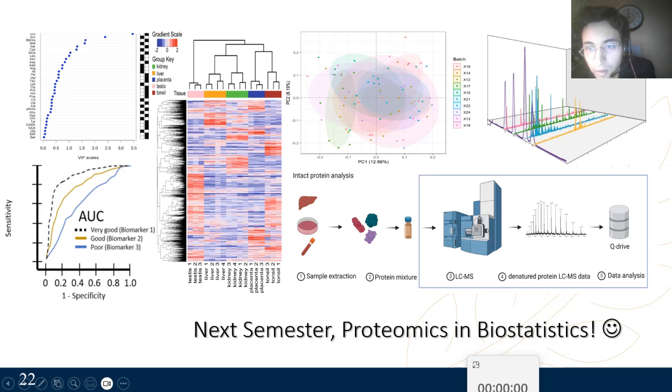Look, from time 0 to time 10, here is the column separation, the separation of the sample using columns. You can separate it using polarity, using hydrophobicity, using whatever you want to use. This is the way you do it, or using cation exchange or ion exchange methods. So this one gets separated, then goes through the mass spectrometer, where the mass spectrometer does a scanning mode on it. Look at that, it only lets the smaller mass and then the highest mass.